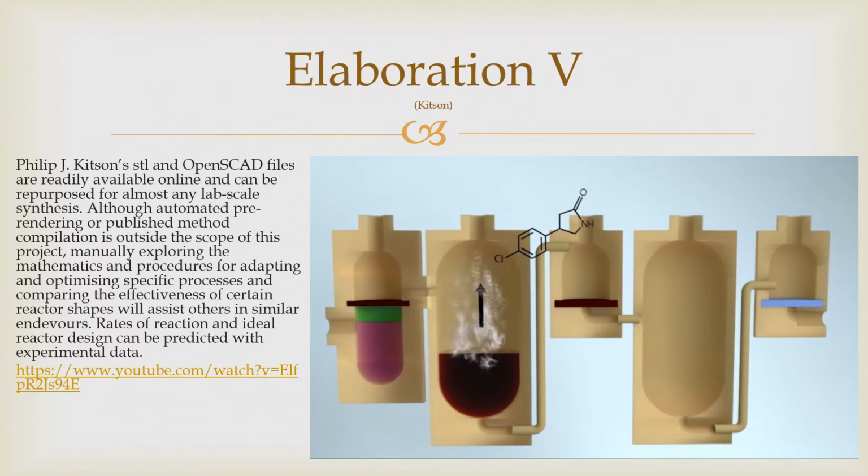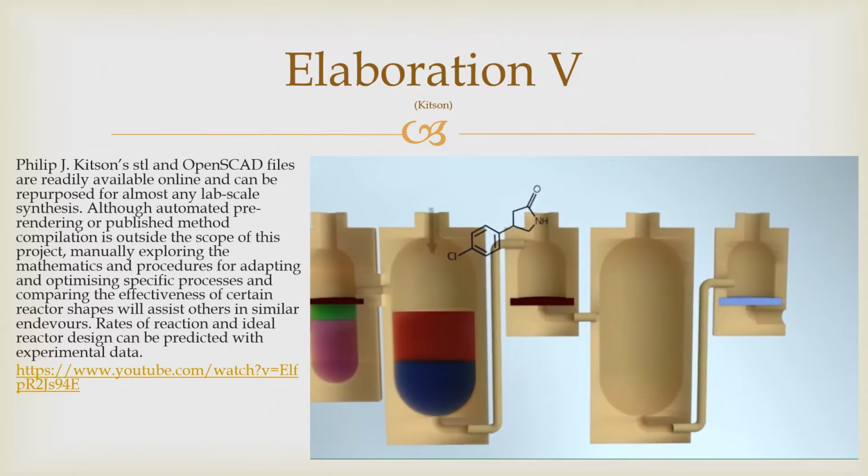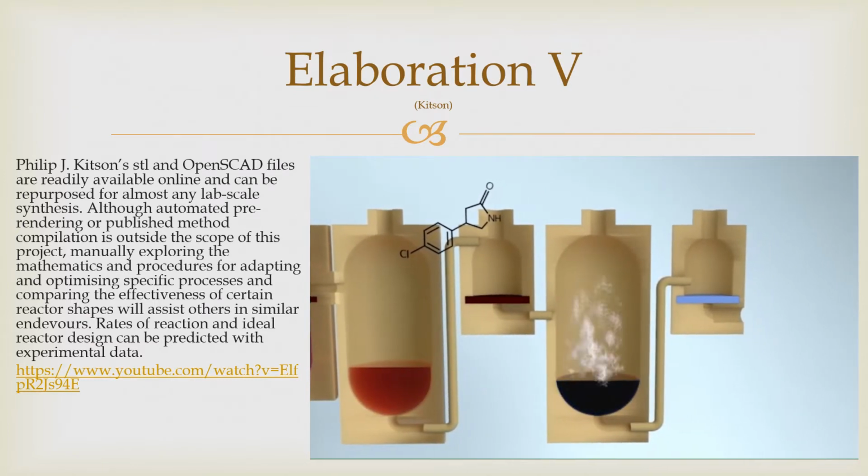Adapting Kitson's STL, OpenSCAD files, and procedures, this study will explore the mathematics involved in adjusting and optimizing specific syntheses and evaluating reaction conditions.